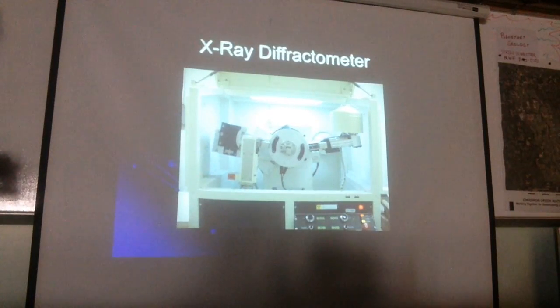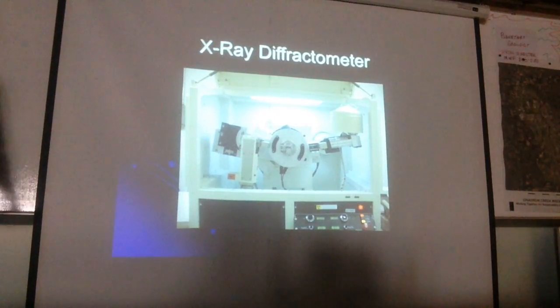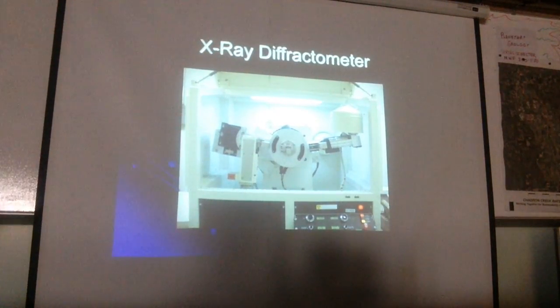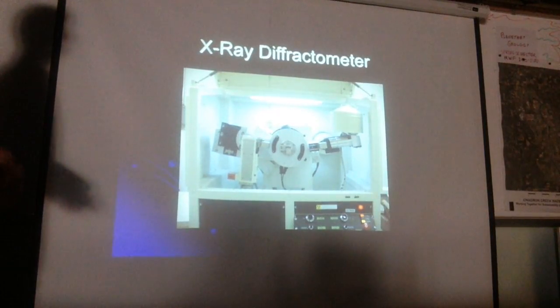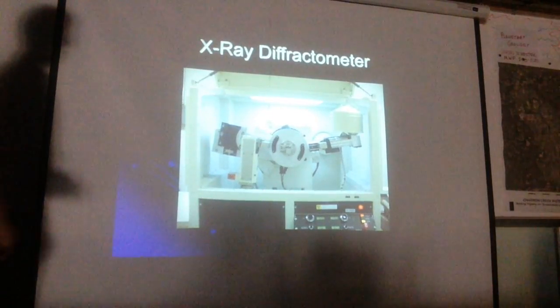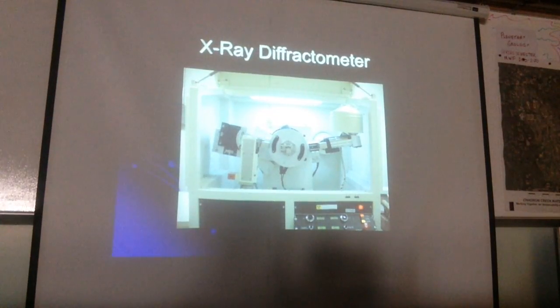There's different types of models. There's tabletop. There's ones like this, which usually stand about this tall, and they have an X-ray tube in there and everything. Which is another important thing when you use an XRD. You're dealing with X-rays, so you want to be careful. Make sure that the machine is closed while it's running, while the X-ray tube is hot.